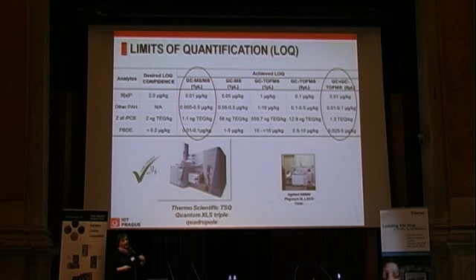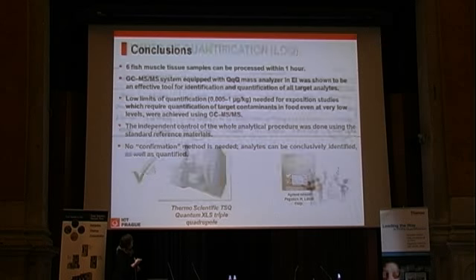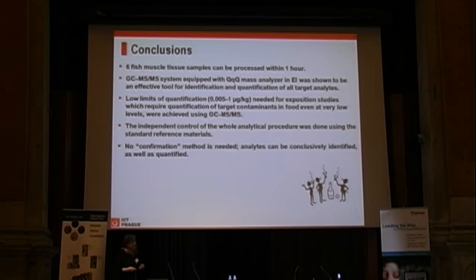I also mentioned this new technique, ambient mass spectrometry. We have a lot of interesting work which is also assisting residue analysis or trace analysis with ambient mass spectrometry. So this is an invitation to a workshop in June, which is co-organized with our colleagues from Thermo, because we work with Orbitrap, and this is our main tool for ambient MS. This is a RAFA associated event, and for those who are interested, I can send the flyer, unless they are not on our target list.